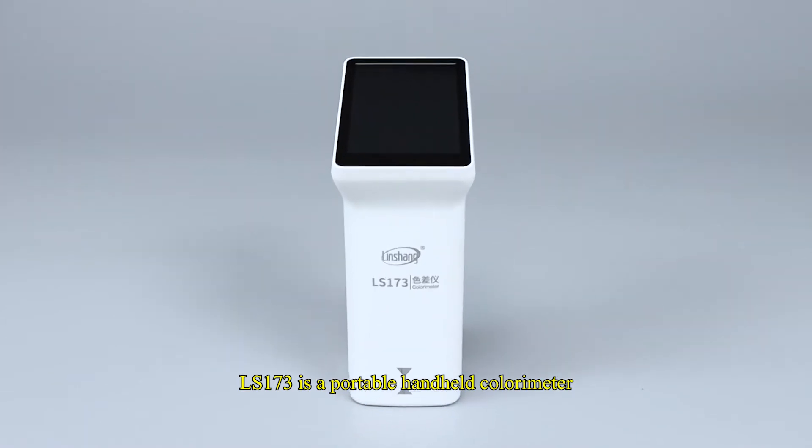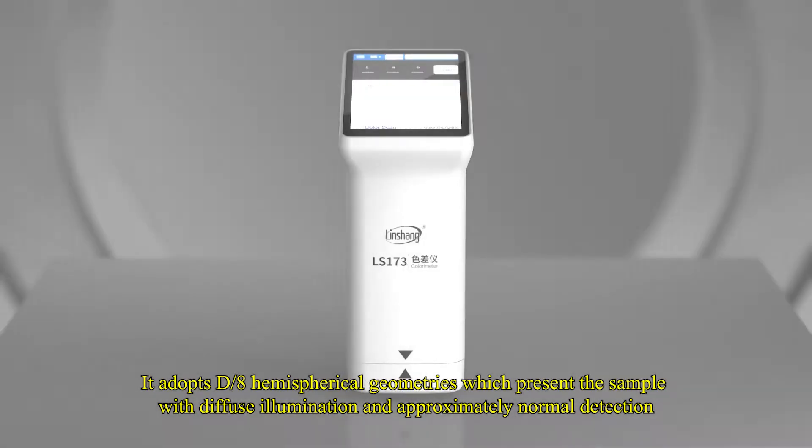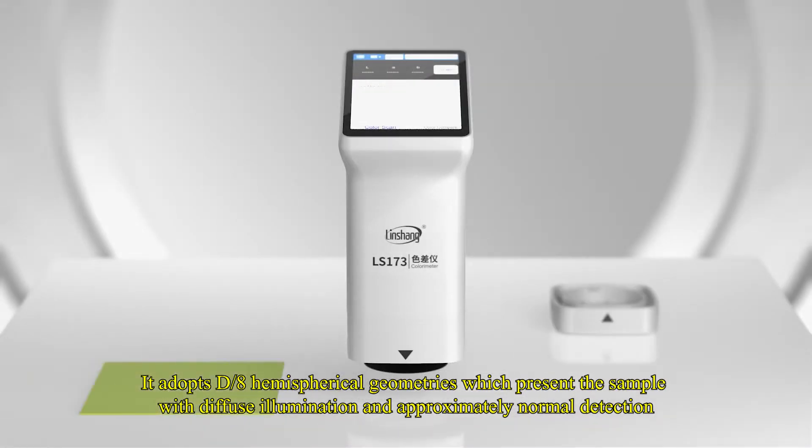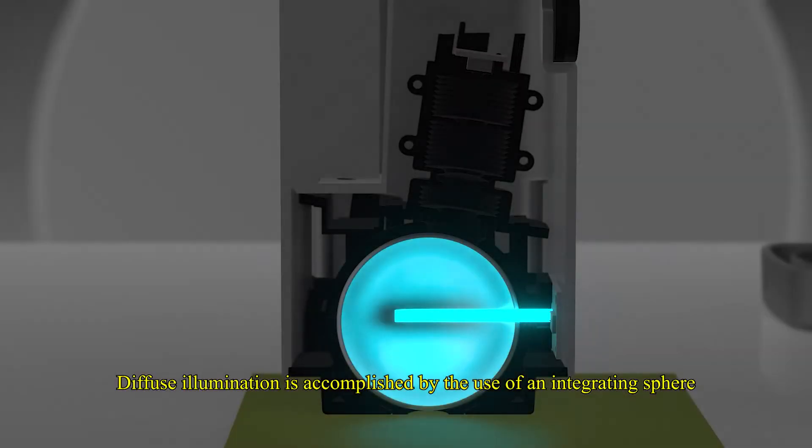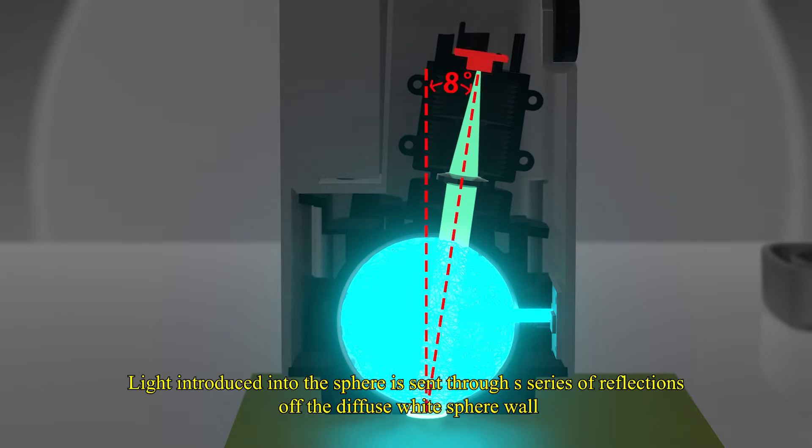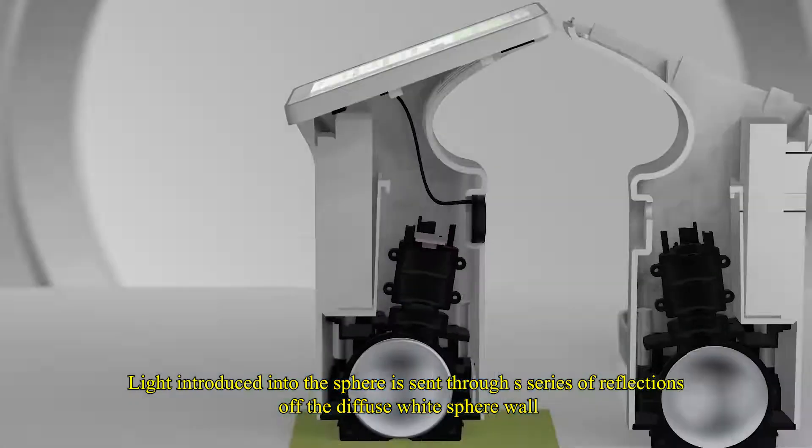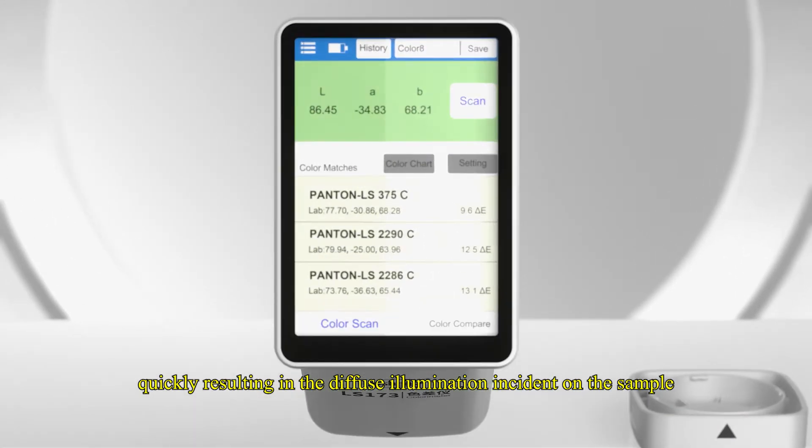LS-173 is a portable handheld colorimeter. It adopts D8 hemispherical geometries which present a sample with diffuse illumination and approximately normal detection. Diffuse illumination is accomplished by the use of an integrating sphere. Light introduced into the sphere is sent through a series of reflections off the diffuse white sphere wall, quickly resulting in diffuse illumination incident on the sample.